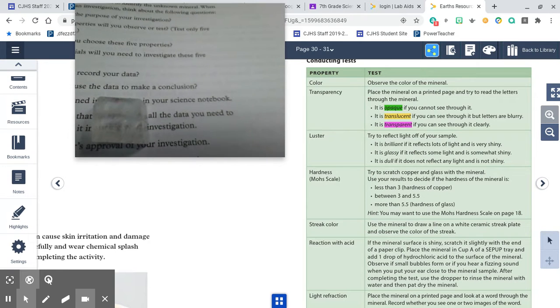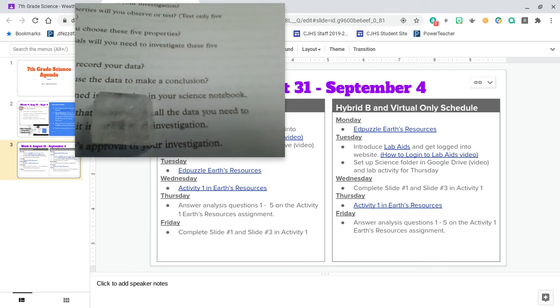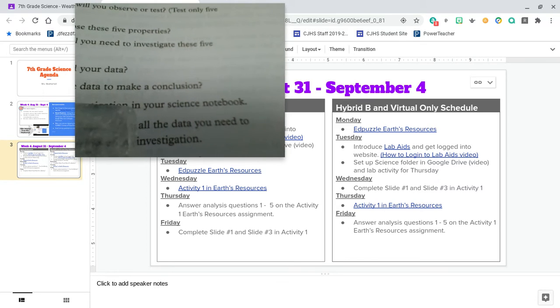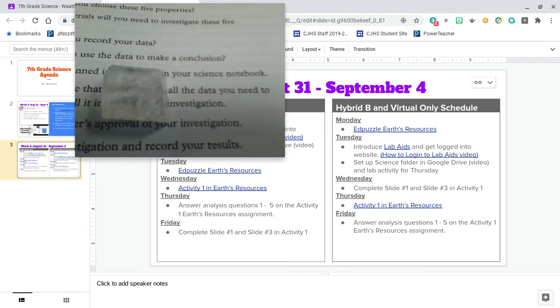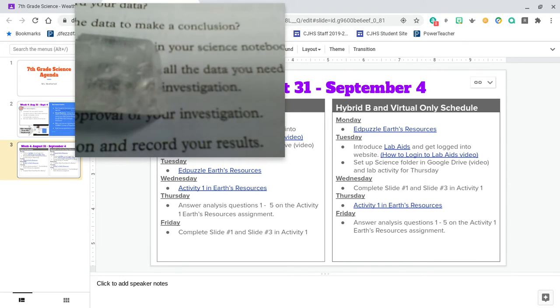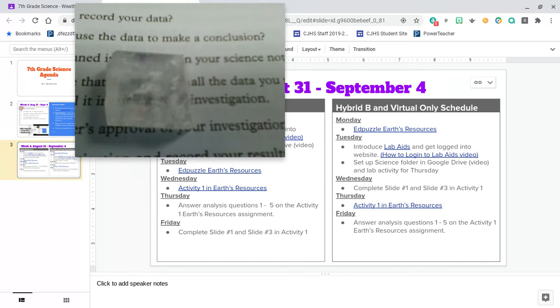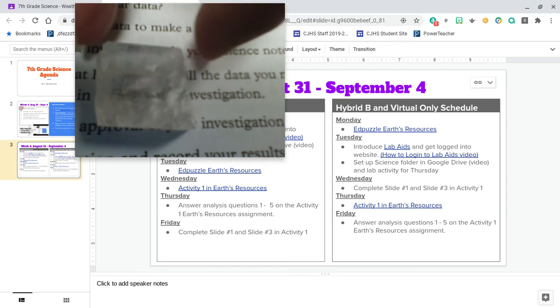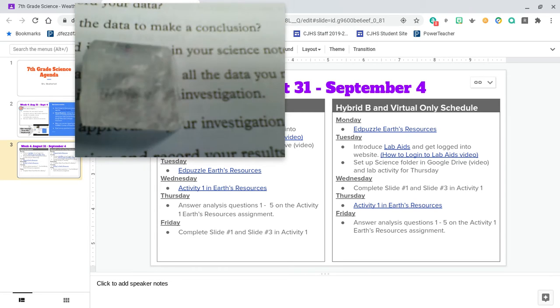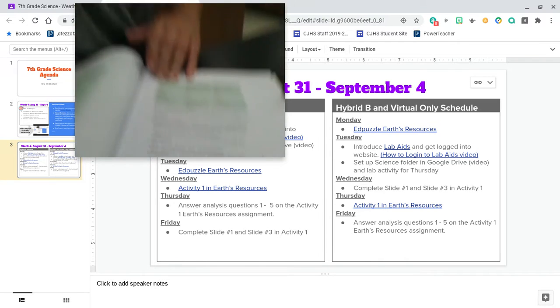If you're able to look through that, I'm trying to angle it here. I'm not sure what you guys can see, but the letters look like a double image. It's not a single image.